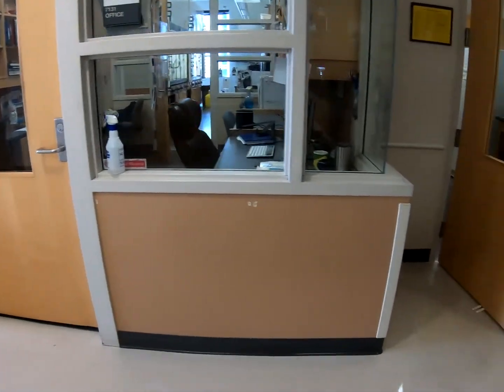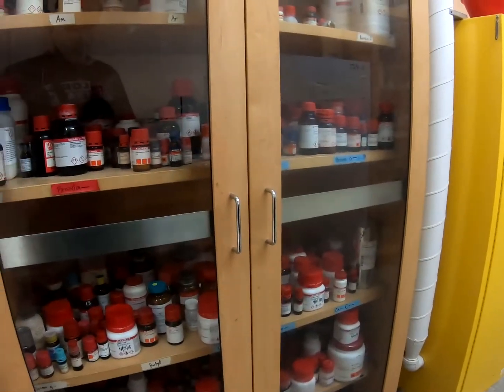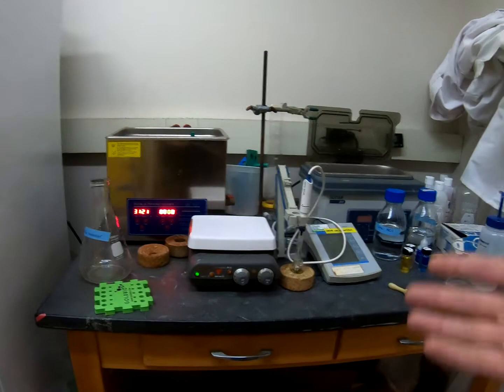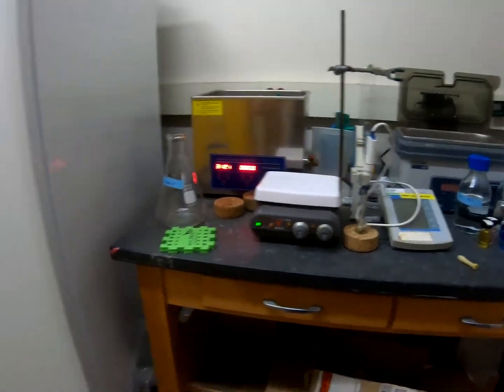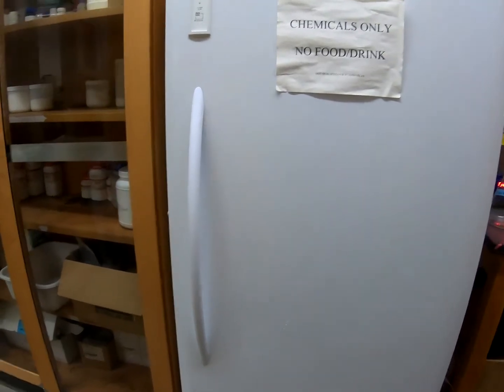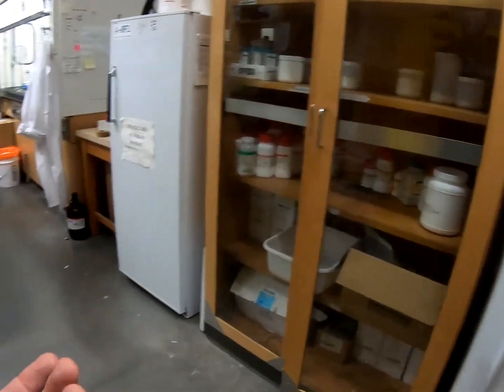This is Lab A, and coming in through the right side of the door here we've got some of our standard chemical storage, as well as our sonicator over here, which we use to dissolve a lot of our compounds, and our pH probe to measure pH. This is one of our freezers where we typically just store peptides we're working on, or any compound that needs to be kept at a lower temperature.